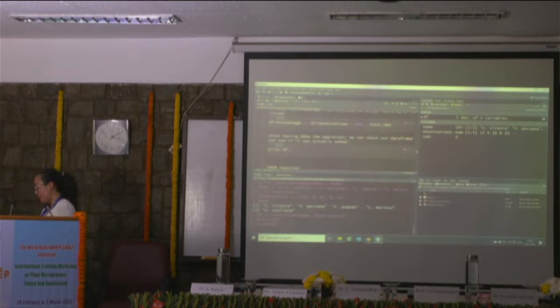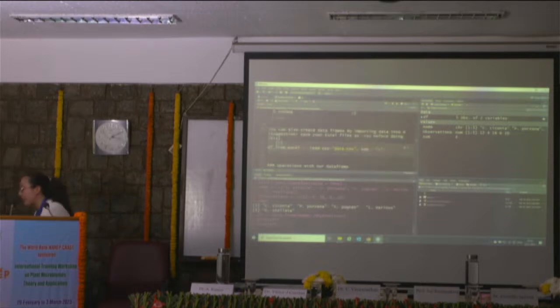Oh, and the other way to get data: you don't necessarily have to write down all your columns like we did. We had 2 columns and we wrote them down. You don't need to do that. You can already have Excel files with your tables and just read them into R. That's why we downloaded another file which was called data CSV. CSV stands for comma separated, what is the V? Value? Okay. So comma separated value. It's a simplification of an Excel file.